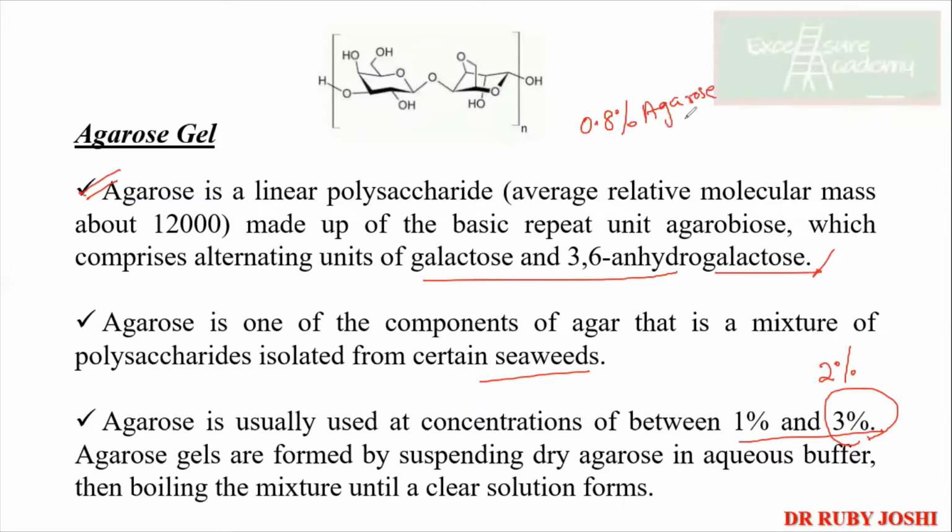Okay. Now, 2% हम कब यूज करते हैं? When you are doing your molecular cloning work, because you need to see the small fragments. So जितना ज्यादा concentration of agarose होगा, high the concentration, what will happen to the pore size? Smaller pore size. Yes, very good. So in the case of cloning, you need to visualize smaller fragments, right? So उसके लिए हम क्या करेंगे? We need more smaller pore size. So you are going to increase the concentration, and यहाँ पे pore size decrease हो जाएगा.